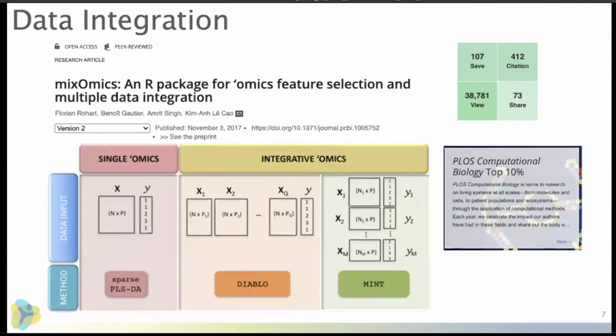So all of the N and P integration tools that we use have been combined into a single R package that Proof has developed with collaborators in Australia called mixOmics, with N integration being under DIABLO and P integration being under MINT. And you can see that it's been cited quite a few times. My job today is to talk about how we've used P integration at Proof.